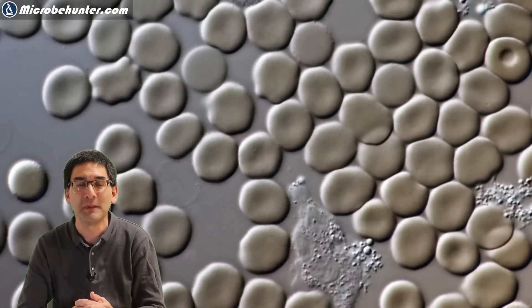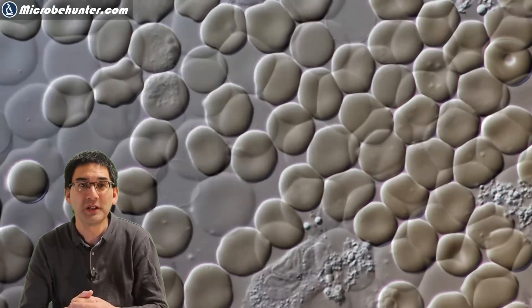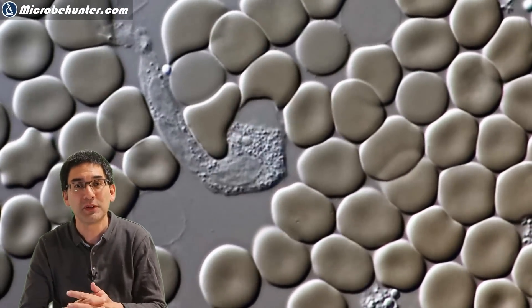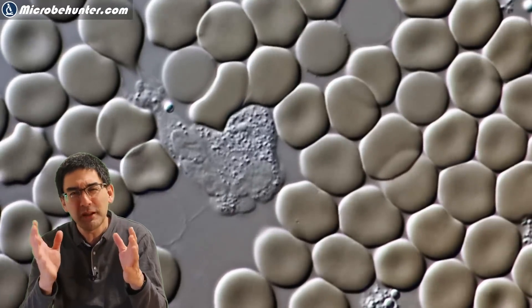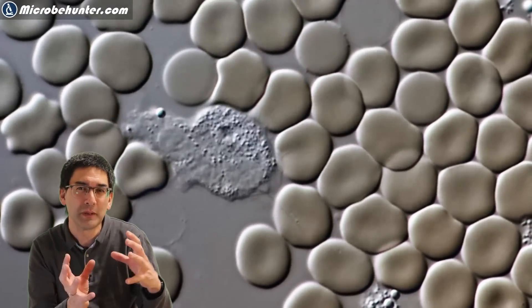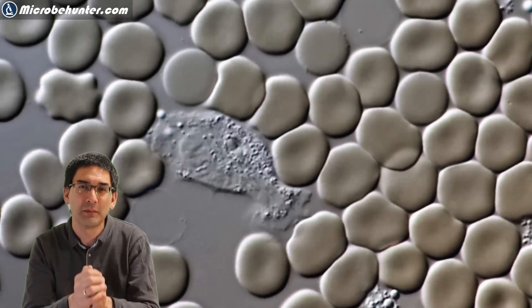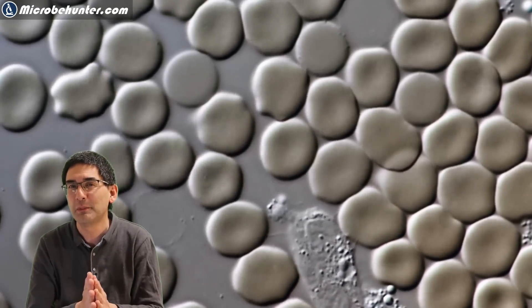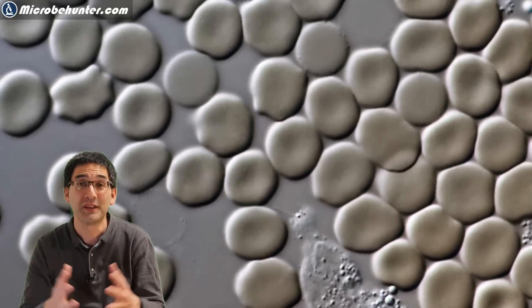I was able to follow this one in particular and I was able to see that it was actually able to engulf certain things that appear to be like bacteria. Like over here, you can see it was actually flowing around the red blood cell to catch those two dot-like structures which could have been bacteria.